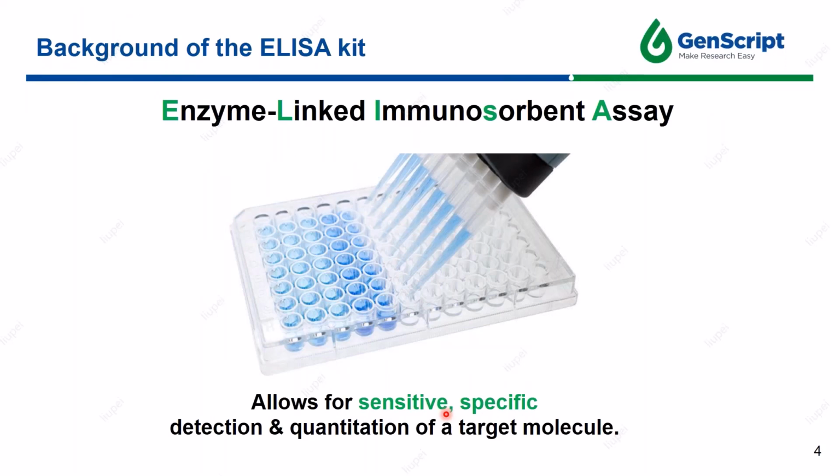As we know, ELISA was first developed in the early 1970s as a replacement for radioimmunoassay. The ELISA is distinguished from other antibody-based assays because the separation of specific and non-specific interactions occurs via serial binding to the solid surface, usually a polystyrene multi-well plate, and because quantitative results can be achieved.